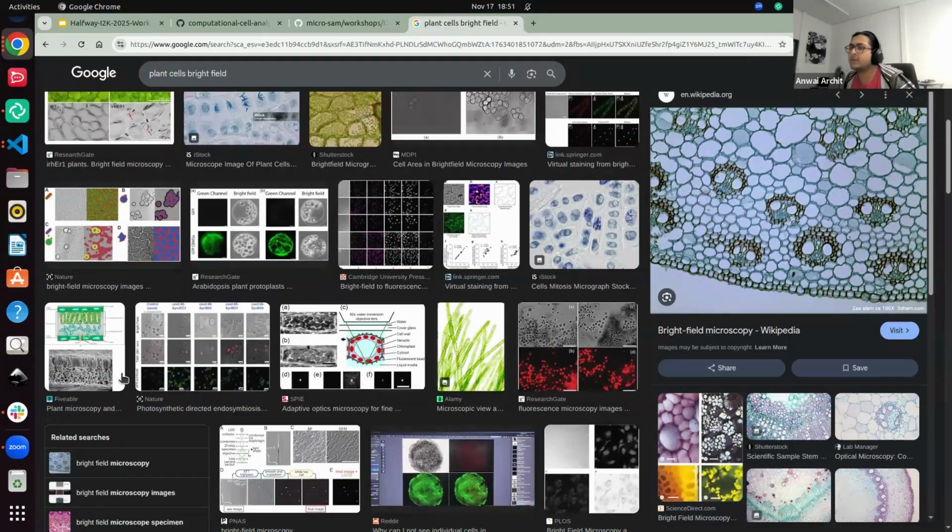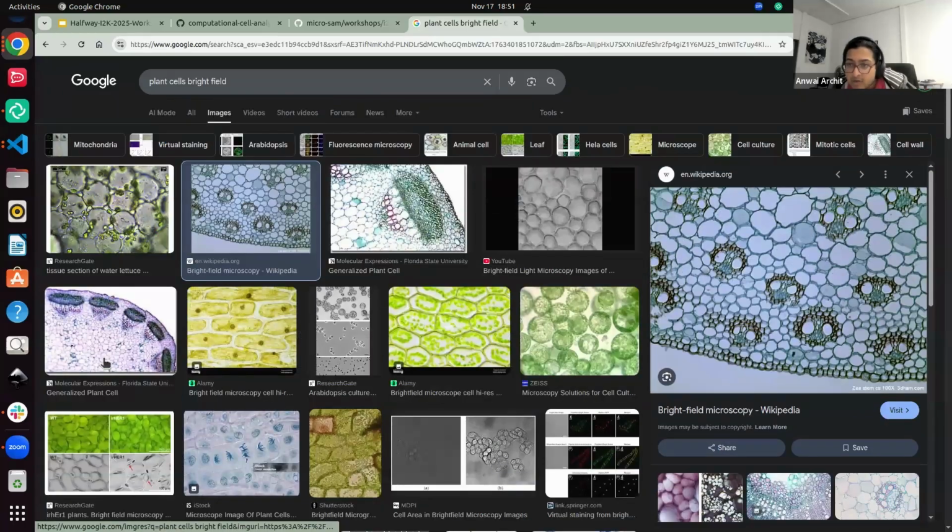I think I have a feeling of what you're talking about, if I'm not wrong. Sorry. Is the model trained on low magnification images of neuronal mitochondria? If not, how can I train the model using my own images? I don't think we trained it on neuronal mitochondria data. I do not remember off the top of my head if we had any. I'm guessing when you say this, you're talking about EM or you're talking about super-resolution? You would take an assumption and say EM. In that case, for EM data, you can really train your own model.